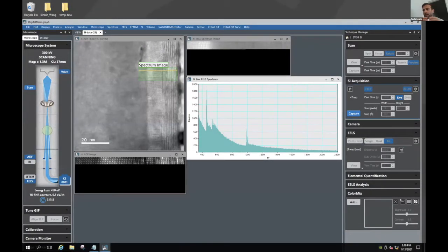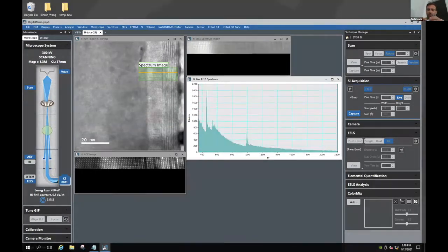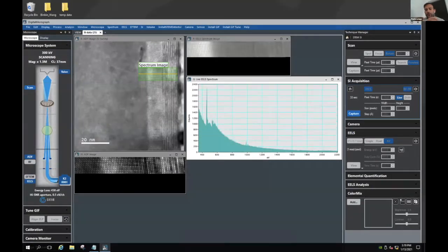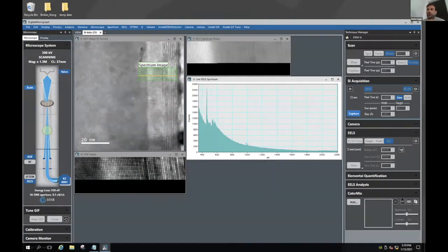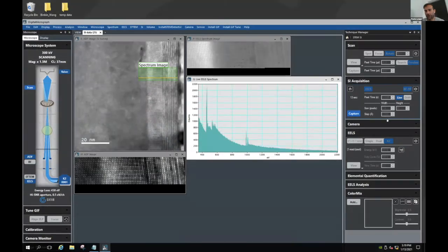So we're actually running the camera at the top speed right now, 2.5 millisecond exposure time. There's actually an interesting thing to say: it doesn't matter what exposure time you put in there, because the camera always runs at 400 frames per second. You can use a short exposure time, but increase the number of pixels and then sum some pixels together. Or you could go for a multi-pass acquisition that I'm going to show you in a second. And actually, if we go up in resolution, we can definitely do that.